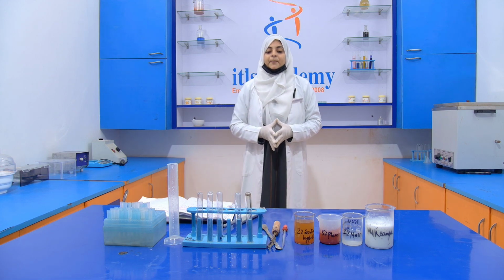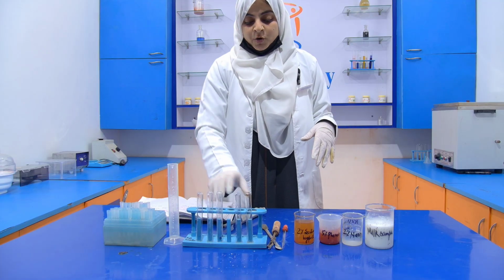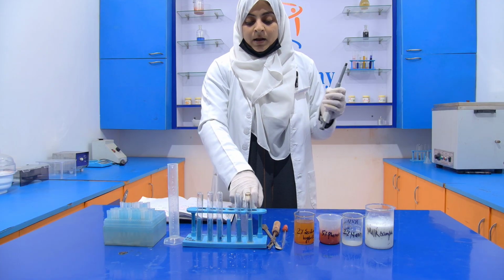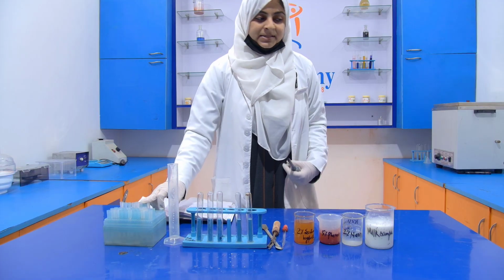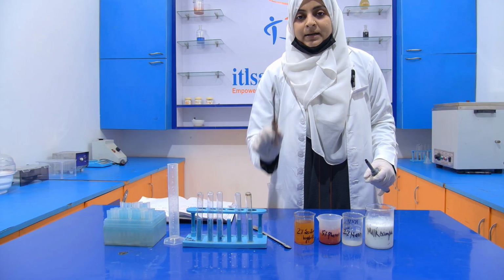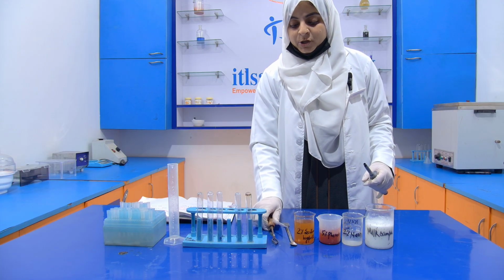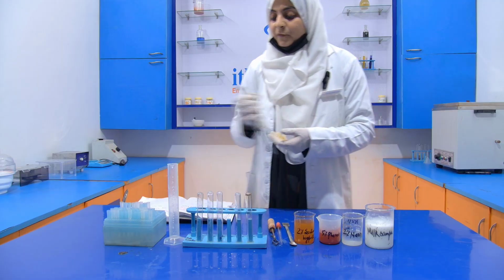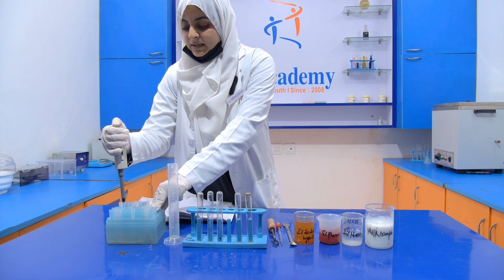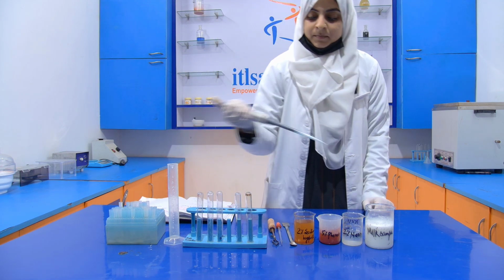Now for performing this experiment, we require milk as a sample, test tube, micropipette of 1000 microliter or 1 ml, test tube stand, micropipette tips, and we require a dropper, test tube holder, spatula, and measuring cylinder. Now what do we have to do? First of all, we have to take 1 ml of the sample into a test tube.